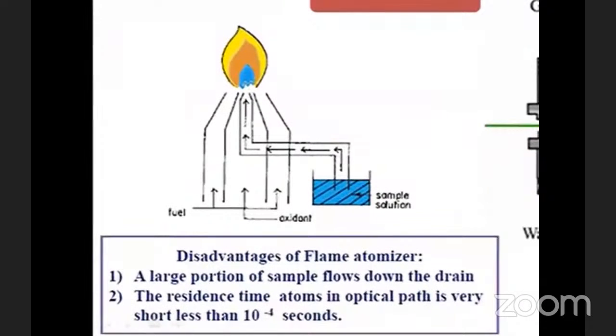The construction and working of both these burners we already discussed in flame photometry. We just recap here about the flame atomizer.